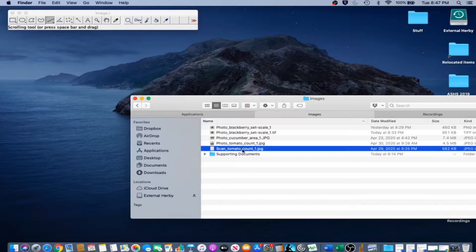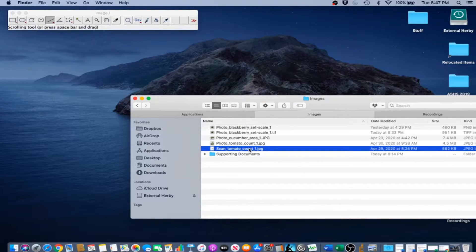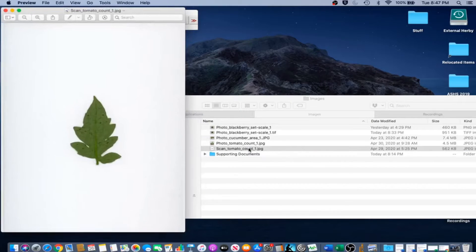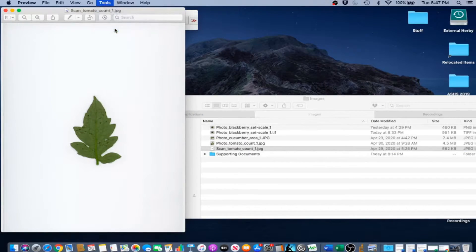On a Mac, the image's physical size in inches, its DPI, and its pixel dimensions can be obtained by opening the image in Preview and going to Tools, Adjust Size.